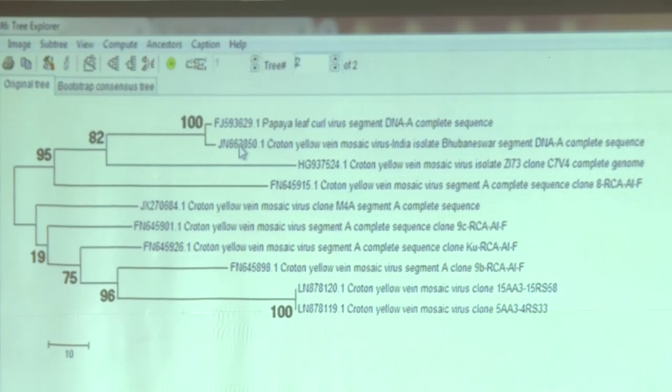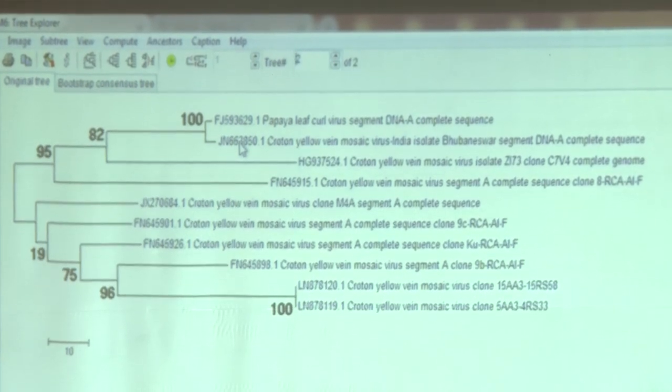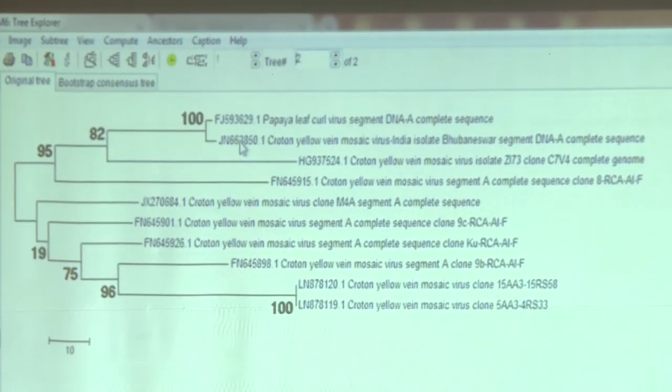Yeah, to supplement whatever Dr. Subramaniam told here, we are not going to demonstrate this here, but the tree can be decorated. Options are available in MEGA. There is one colored icon, the fourth one in the top row. You just click it, and it opens up a drop-down menu. A lot of options are there. You can make this line thicker, bolder, or lighter. Those are decorative items. In MEGA 10, there are even more.